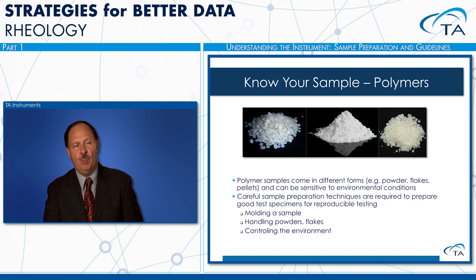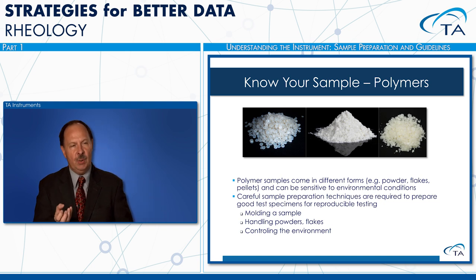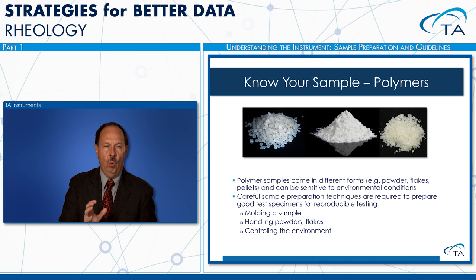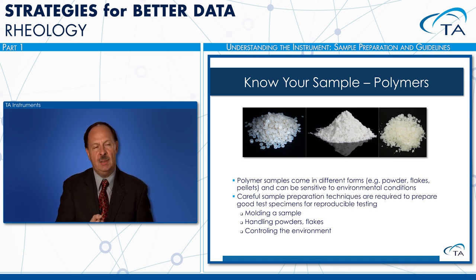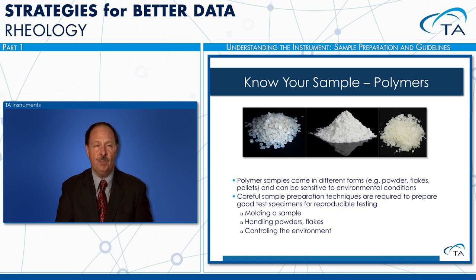A lot of the times when people are looking to evaluate polymeric materials, it's going to be in the form of a melt. Sometimes you can get the fluff, like out of a reactor, or sometimes there are other cases where you're getting a polymeric material in a flaky or powdery form that we'd like to get the measurements of the rheological properties of. And here we also show the example of a flaky material as well.